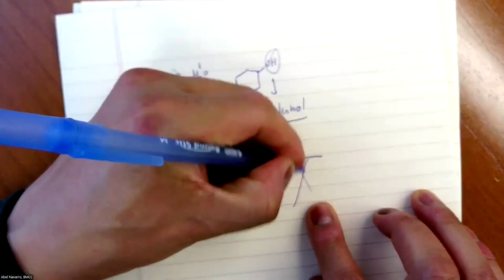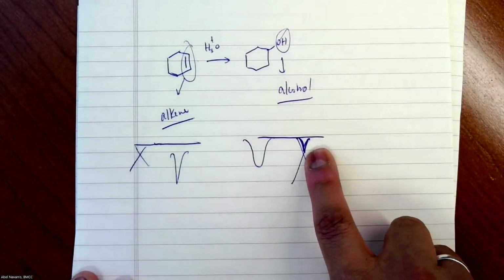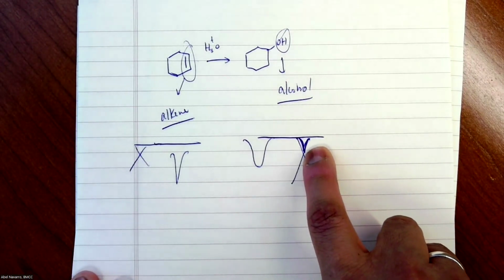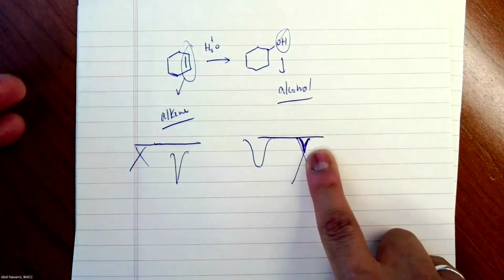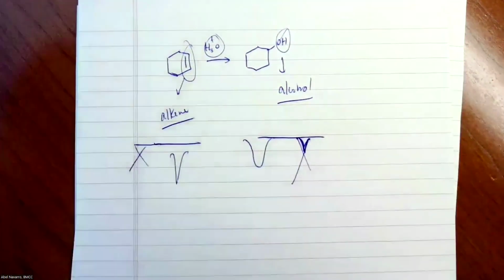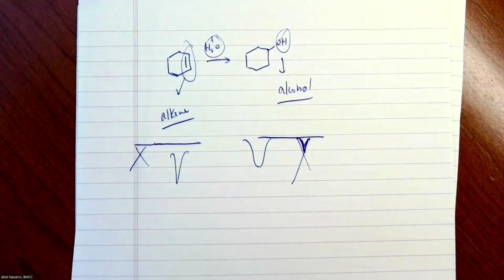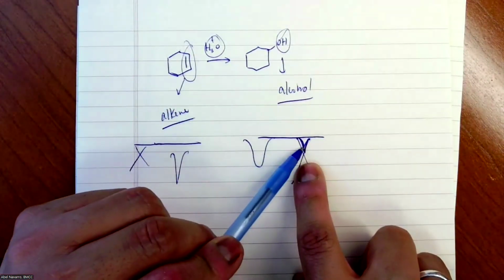What happens if I see something here? What would you say? It says that not all my starting material reacted. Maybe I need more time. I need more reflux. Maybe I need to add more acid, right? So that's what it's telling me. So you can actually do a time dependence based on infrared spectroscopy. Okay, the reaction for 10 minutes, not done yet. Use IR. 20 minutes, not done yet. That's by IR. So with the infrared, you can determine if your starting material is gone or not.